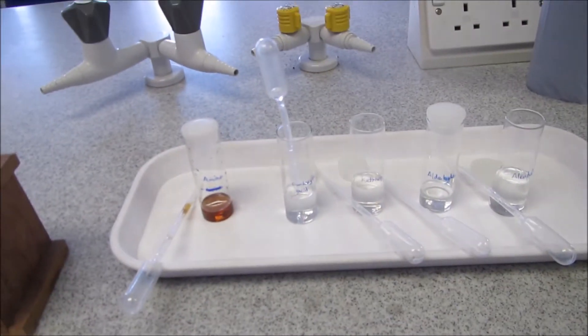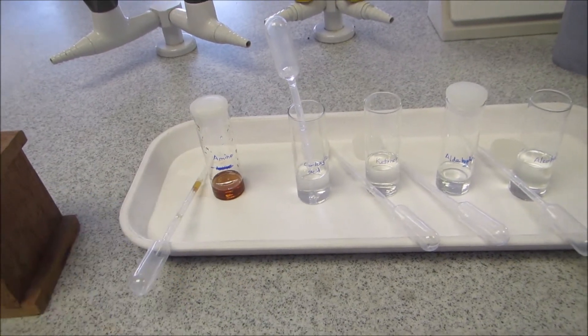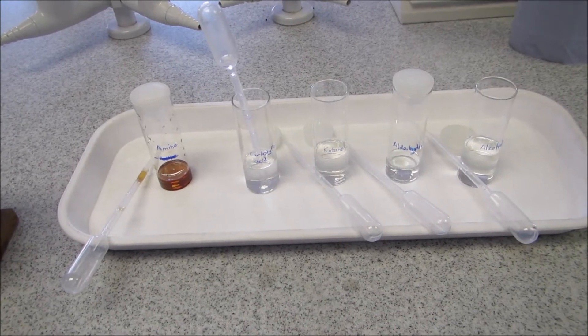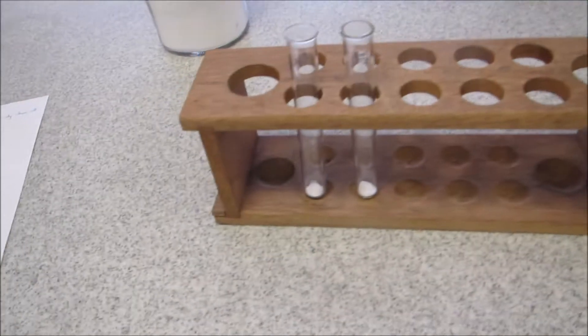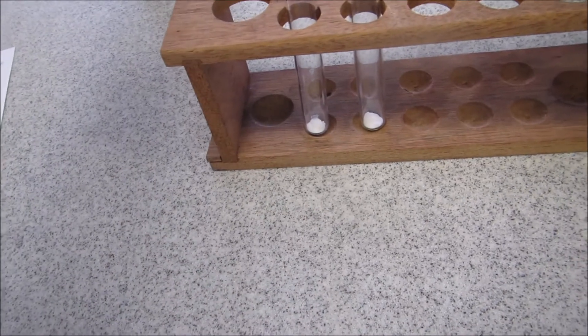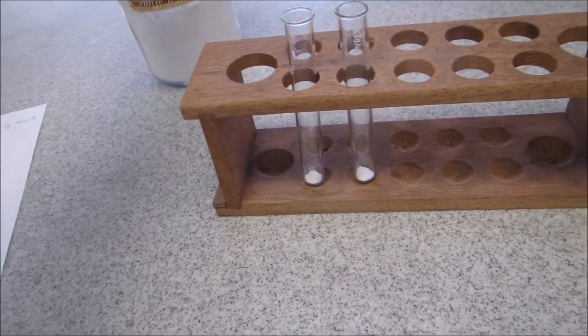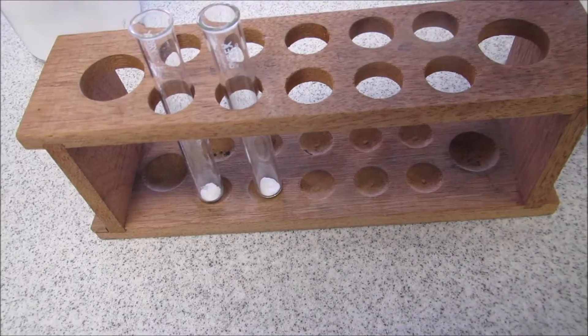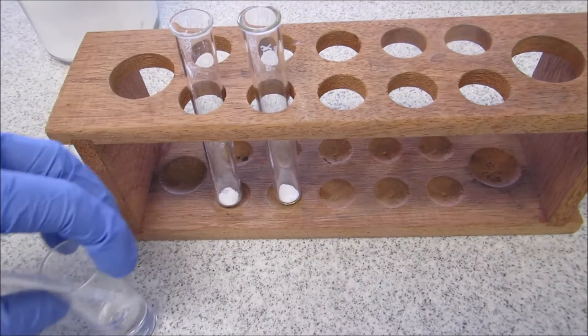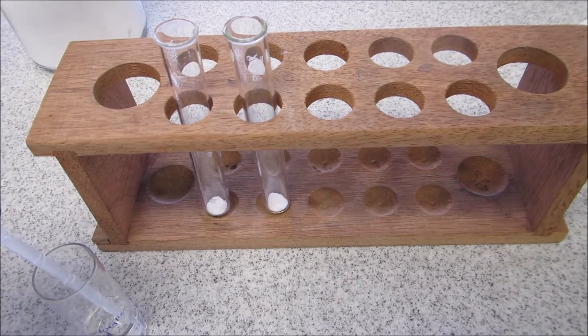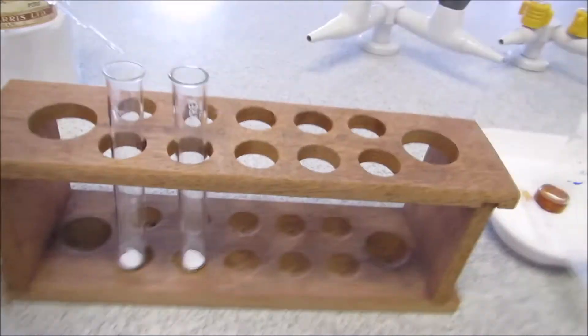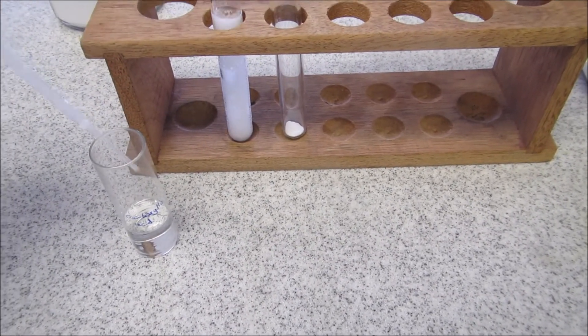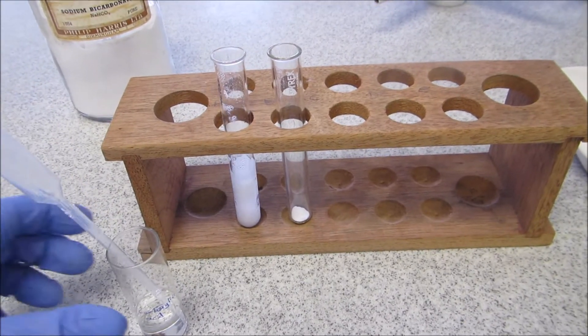So from the pH test we were able to identify our amine, so I'm not doing anything further with that. But now I want to try and work out which is actually our carboxylic acid. So I've added some sodium bicarbonate to the bottom of two test tubes. I'm just going to show you the reaction that happens with the carboxylic acid. I'm just taking the carboxylic acid first, and you can see there's a lot of fizzing or effervescence.